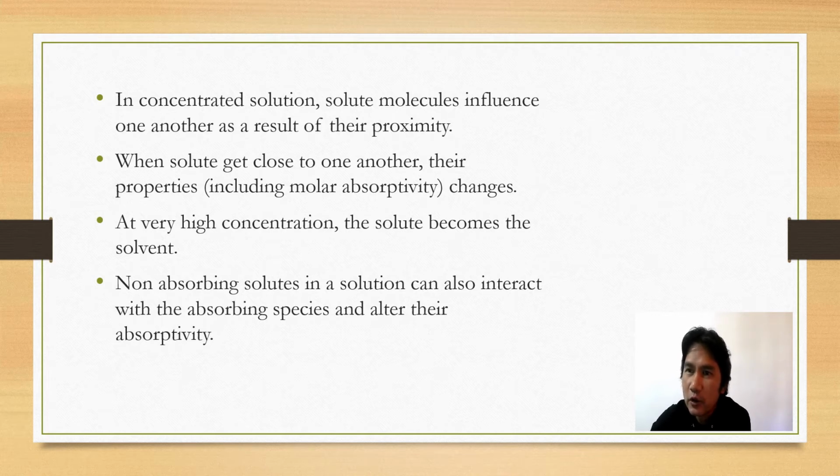What happens in concentrated solution? In concentrated solution, there are many solutes, and solute molecules influence one another as a result of their proximity. When solutes get close to one another, their properties, including the molar absorptivity, change. Remember, molar absorptivity is the inherent characteristic of the absorbing species.